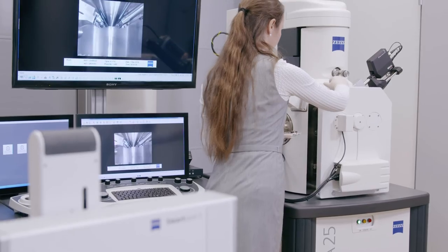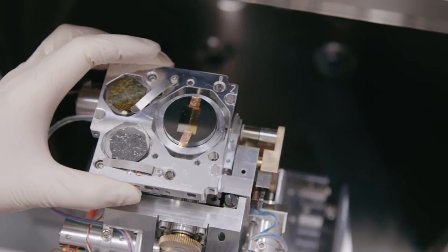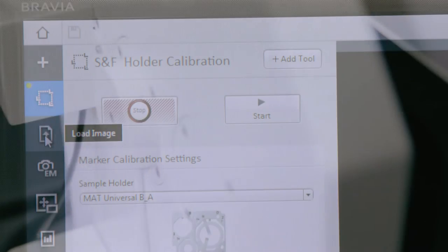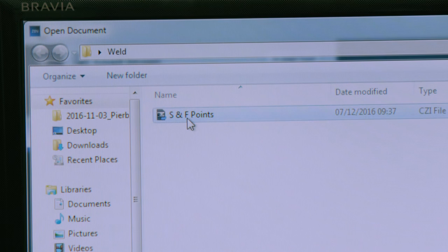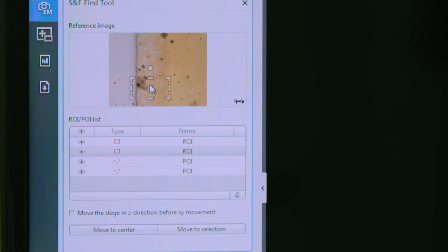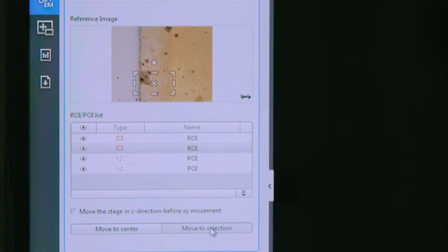Once you have shuttled your sample to the SEM, you can skip the time-consuming search for your regions of interest. Simply load the sample and perform a calibration that is done almost automatically. Then click on a previously marked position and the SEM finds the corresponding location within seconds.